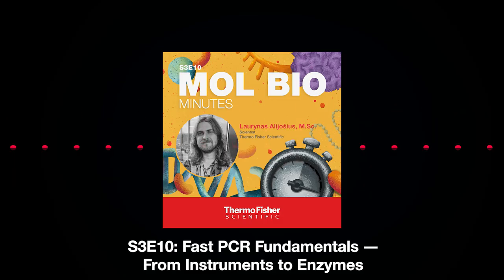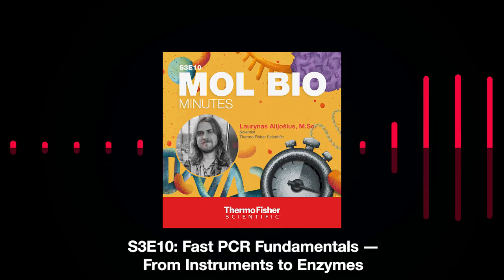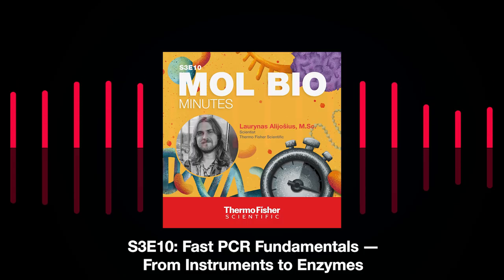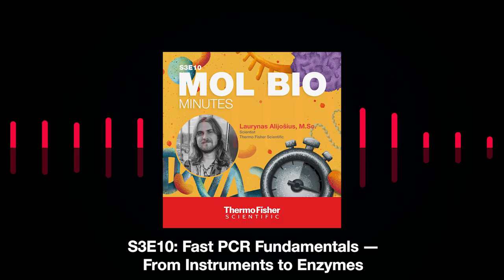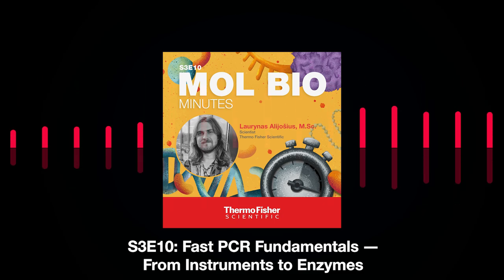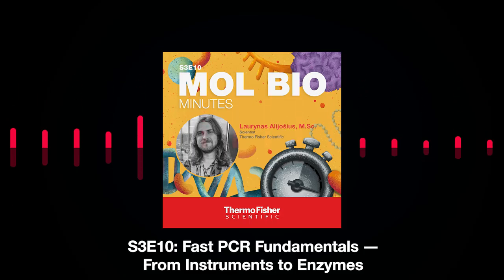So, what is the real secret sauce to achieve the fast pace of the PCR? And there's one magic word that works wonders with PCR, and the word is optimization. So, optimizing your PCR reaction can lead to some beautiful results, and more importantly, it can improve the efficiency of your PCR reaction. And in the end, that's what we want, right?